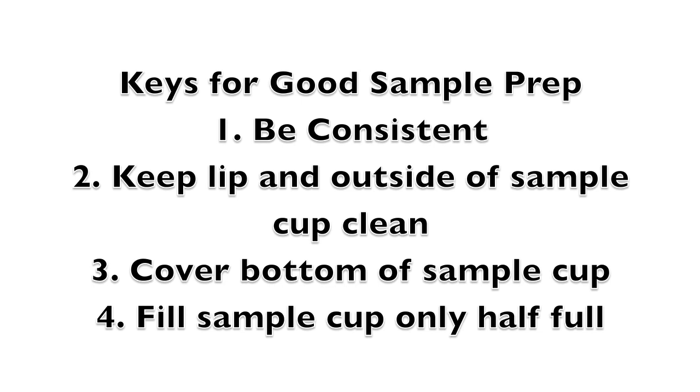Second, keep the lip and outside of the sample cup clean. Although the Series 4 is easier to clean than earlier versions of the Aqualab, you can save yourself a lot of time by avoiding contamination in the first place. Third, covering the bottom of the sample cup completely will ensure an accurate sample temperature. And fourth, filling a sample cup only half full helps you avoid other instrument cleanliness problems.